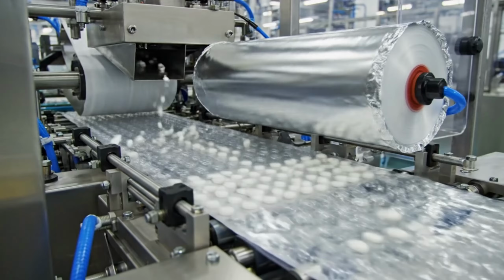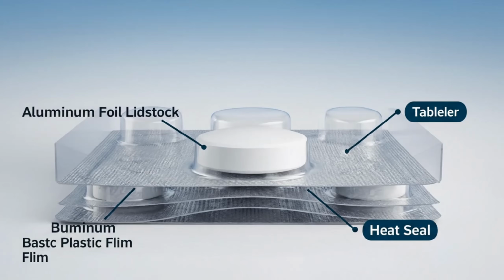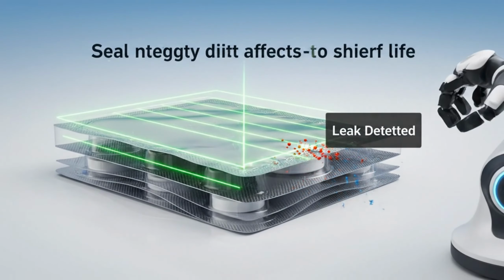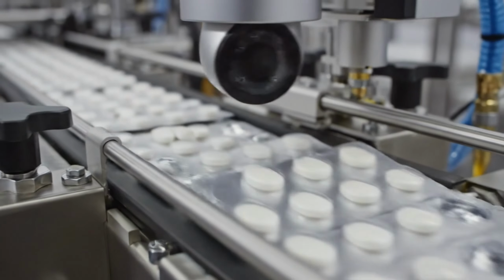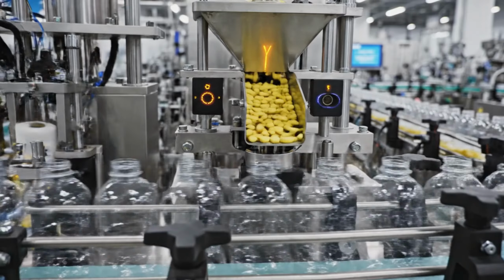Once a batch has passed all quality control testing and received formal batch release, it enters the packaging operation. The integrity of the blister seal directly affects product shelf life. A compromised seal allows moisture in. Automated vision inspection systems photograph every blister pack at high speed. The system checks each cavity.